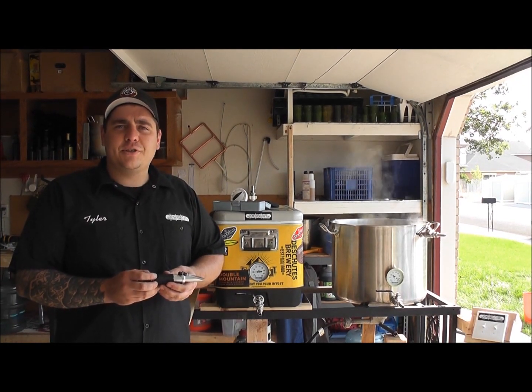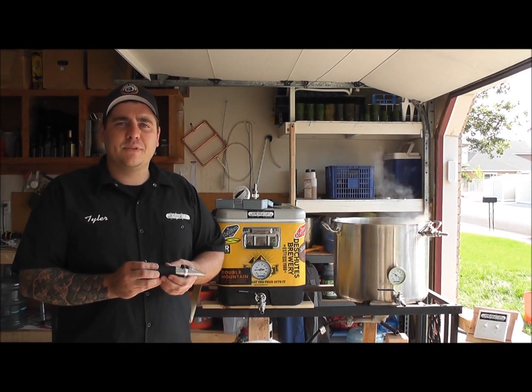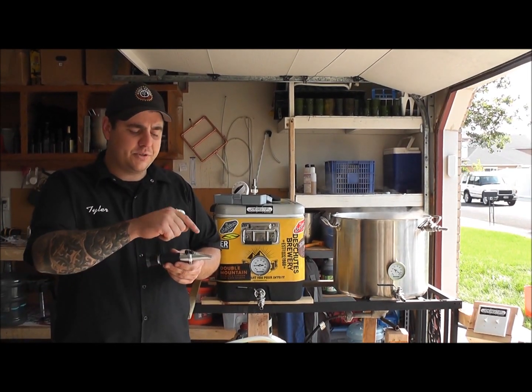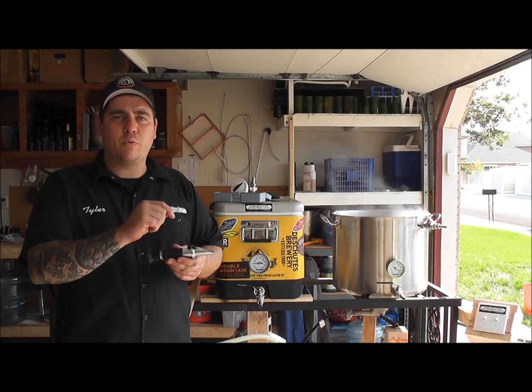This is Tyler from Homebrewstuff. Today I'm going to show you how to use a refractometer. First, to be able to zero it out, you will put three drops directly on the lens of purified water.